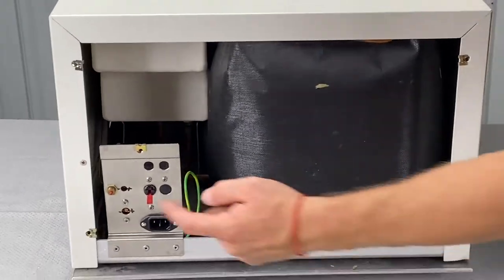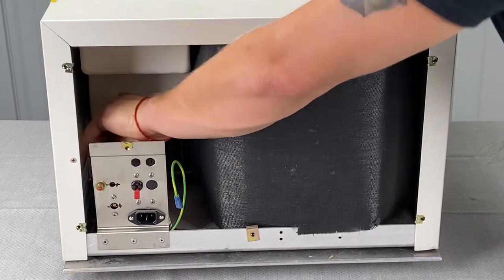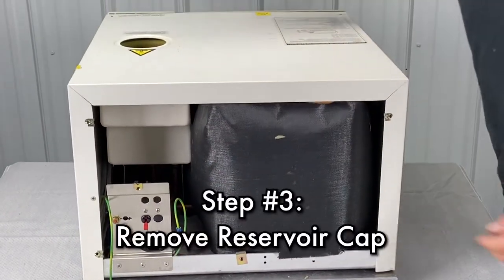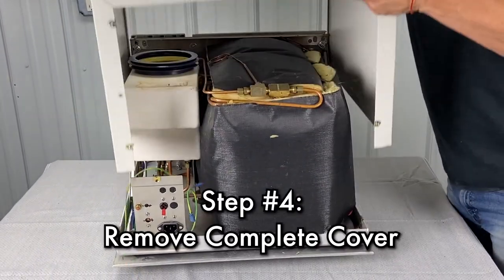Another good practice is to make sure the unit is unplugged. I should have said that in the beginning, but hopefully that's self-explanatory. And then here's your ground to the top. Take your cap out so you don't break it.